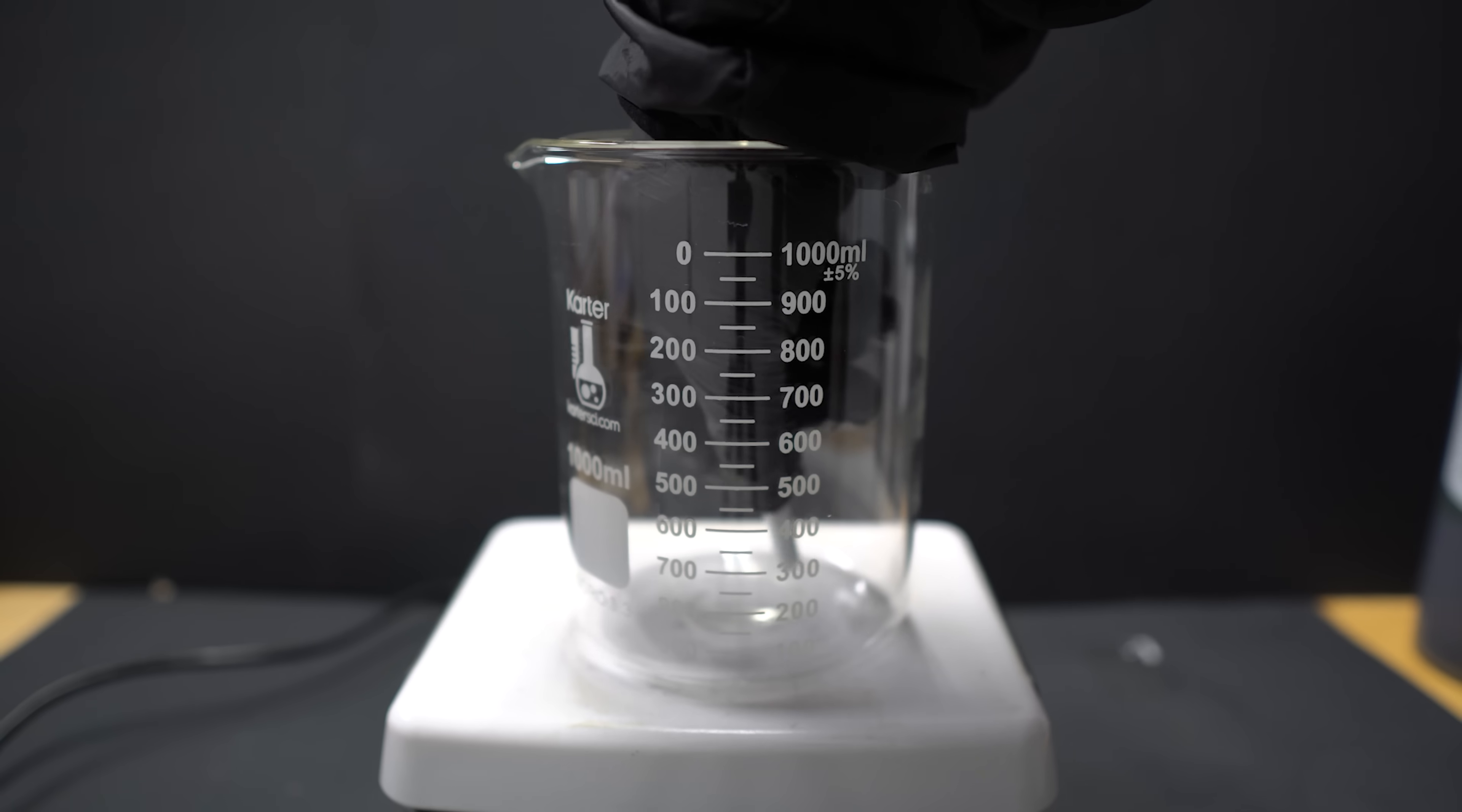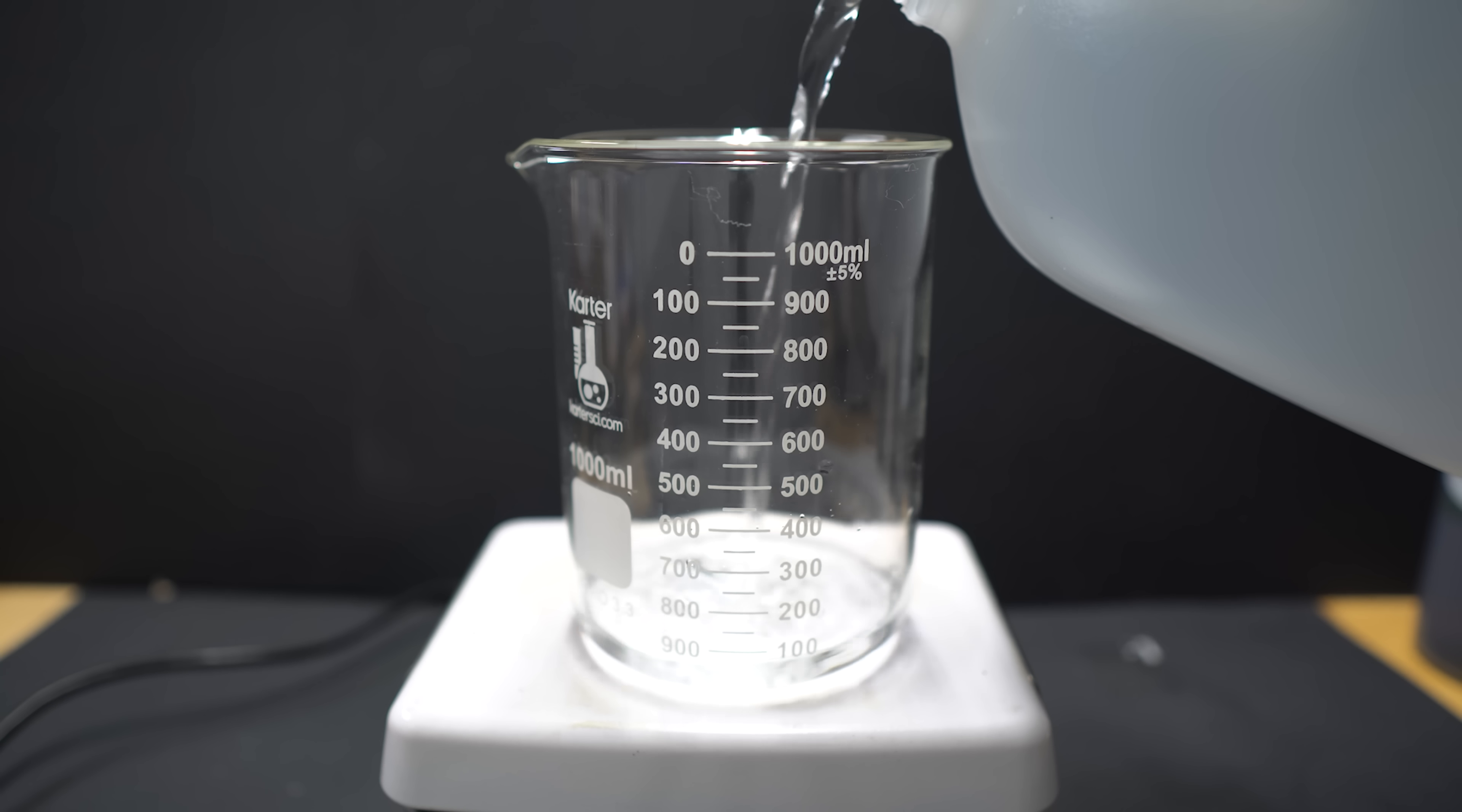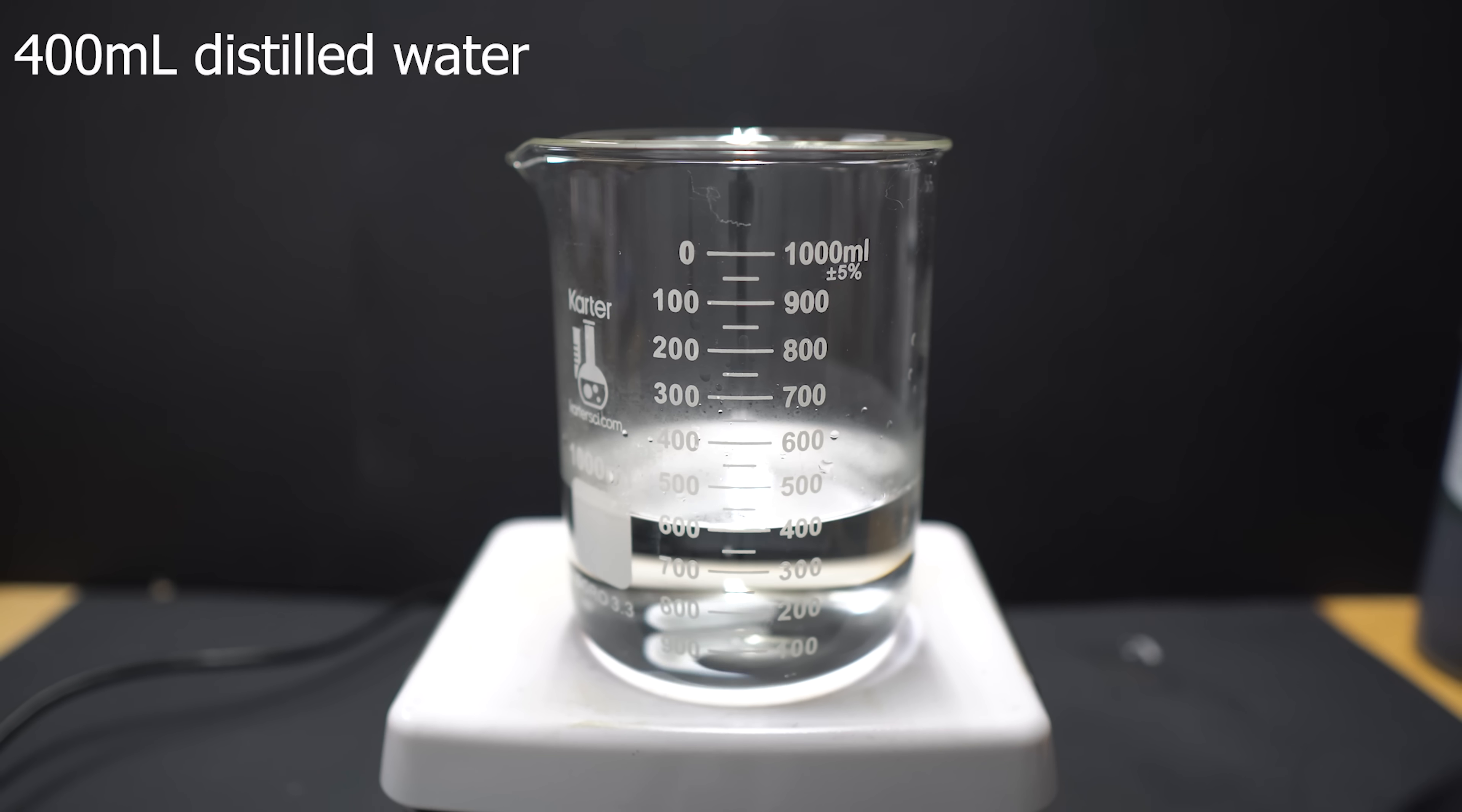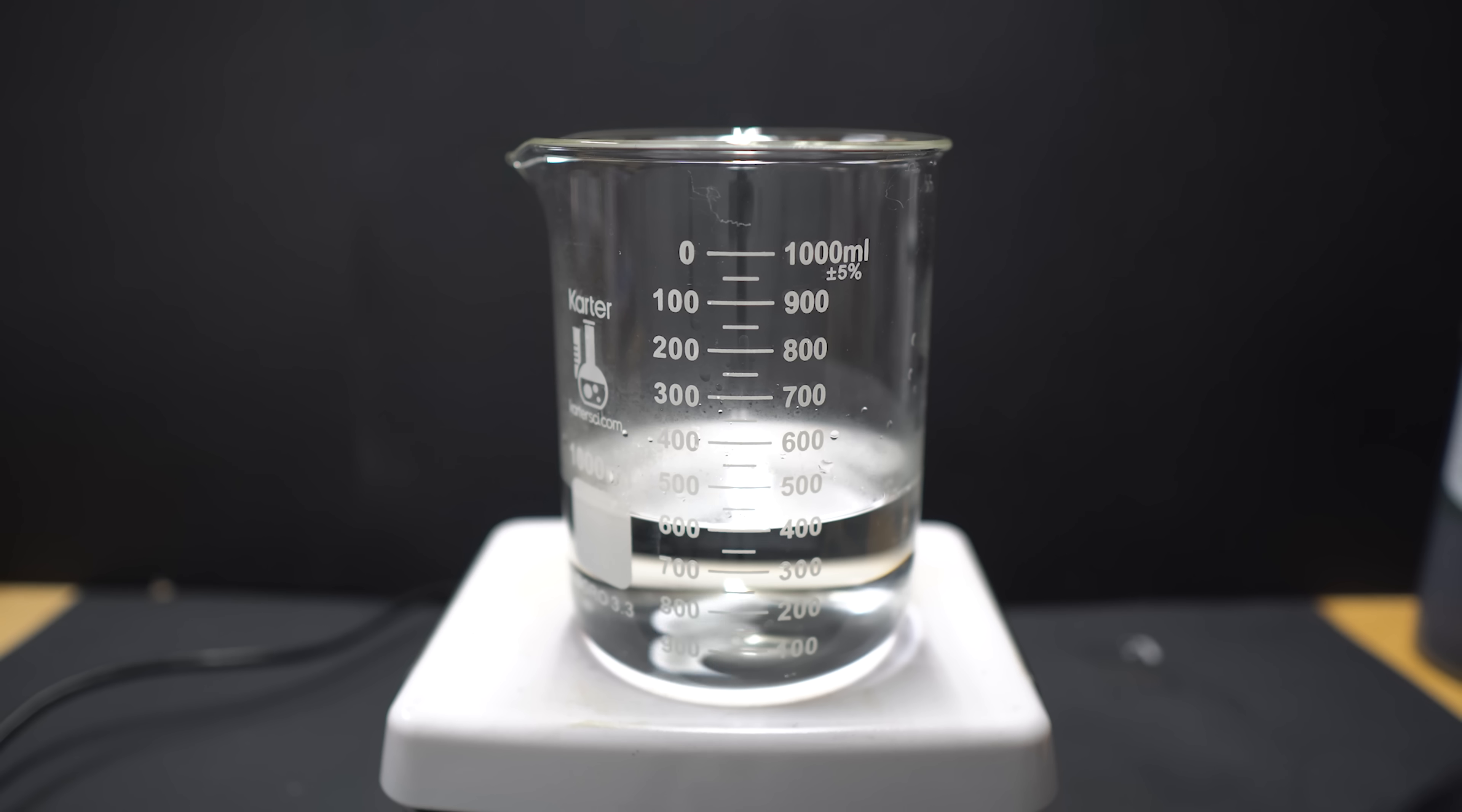I'm first going to get a 1-liter beaker, and I'm going to put a stir bar into it, and I'm going to fill it up to about 400 milliliters of water. I will be using NerdRage's hydrobromic acid tutorial, so that's what I'm going to be using today.